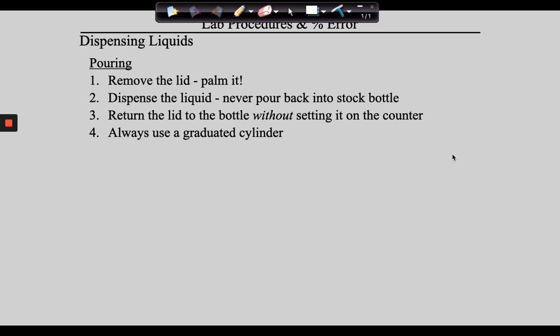So you come along, you get what you need. When you're done, you screw the lid back onto the bottle and you're all set. Now, what happens if you do get too much? Where does it go? The answer is down the drain or in a waste beaker, depending on if it's dangerous, and I'll always let you know. But please don't ever pour back into stock bottles, okay?